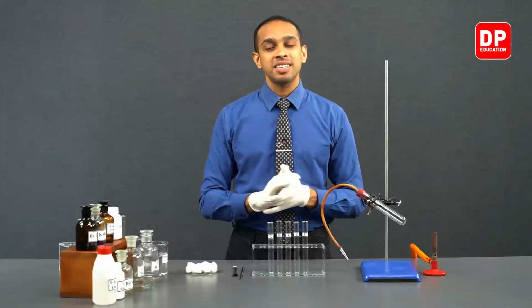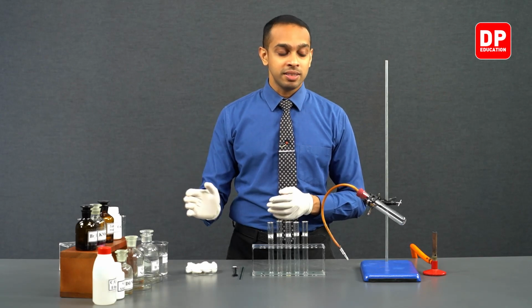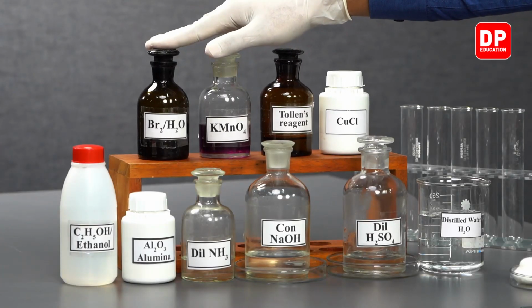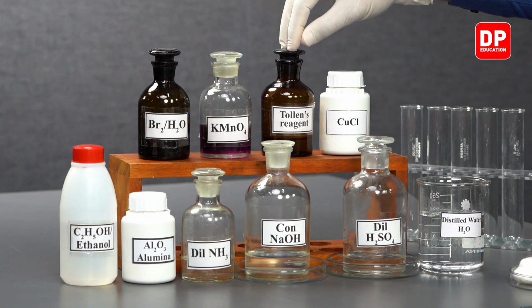Now let's move on to identifying the chemical reagents and the equipment we will be using for this experiment. Students, we have in front of us the chemicals and the equipment. We have bromine water, potassium permanganate, ammoniacal silver nitrate or Tollens' reagent.